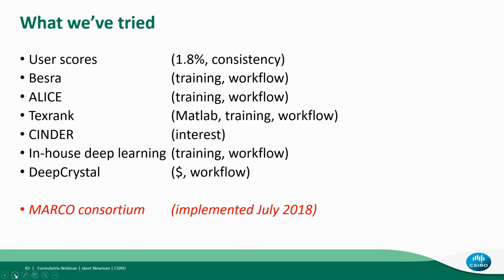And at the time we were doing this, it became obvious that deep learning was going to be the way to go. And so we started doing some in-house deep learning experiments, and then we discovered that there was a company in California that was specializing in this, called Deep Crystal, and we worked with them, and we got some machine learning workflows up. Wasn't really very good, but it was okay.